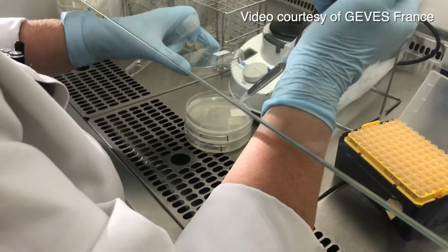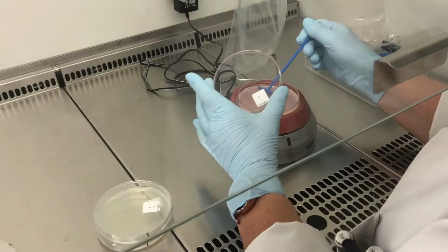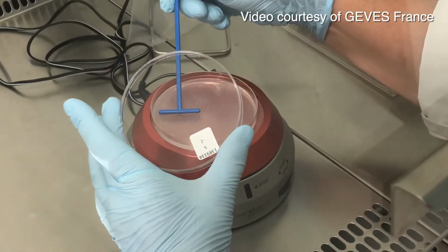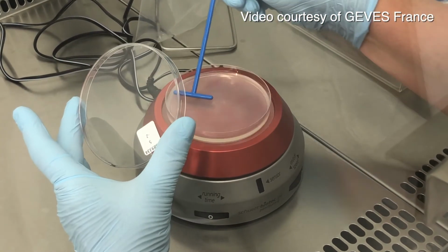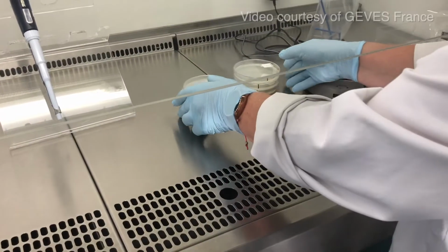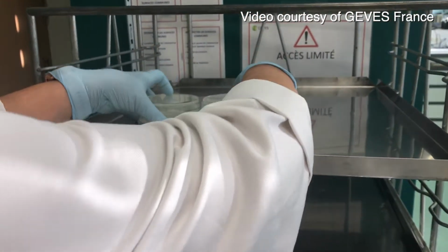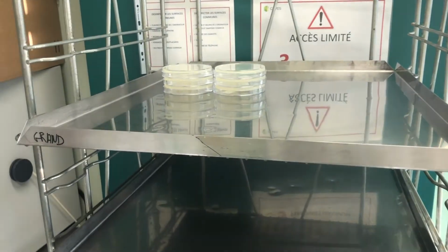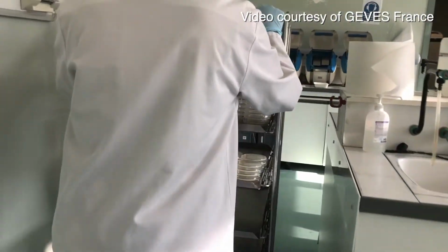But with the pathogenicity test, we had one issue. It's that it was really time-consuming, and there was a big lead time for the whole method due to the pathogenicity test. So also, not every lab had the growth chamber to perform it, and also the experience and expertise in pathogenicity tests.